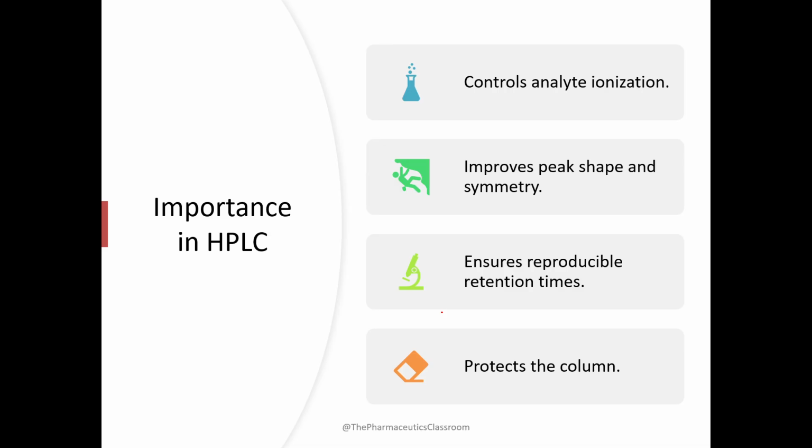So what is the importance of buffer in HPLC? It controls the analyte ionization. Like in the second or third slide I told you why controlling of ionization is important. We want most of the molecules to be either in ionized form or unionized form.